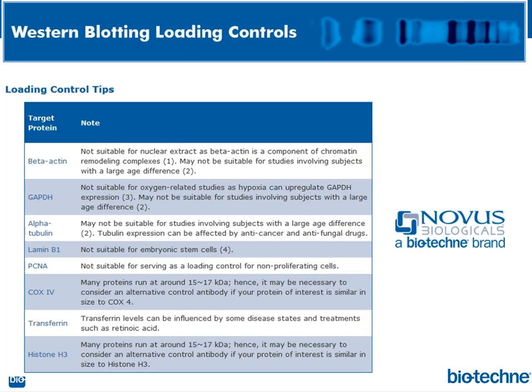Now, I'm showing the loading control page here, and I read something here about age. Let me see here. I bet you most of these are not affected, but there's probably one that is affected. Beta-actin may not be suitable for studies involving subjects with a large age difference. I don't know if that's exactly what she was referring to. I don't know the answer to her question. I would just say that probably most are not affected, but that's something you're going to have to investigate a little more. But I've not had any experience in that area other than what you see here.